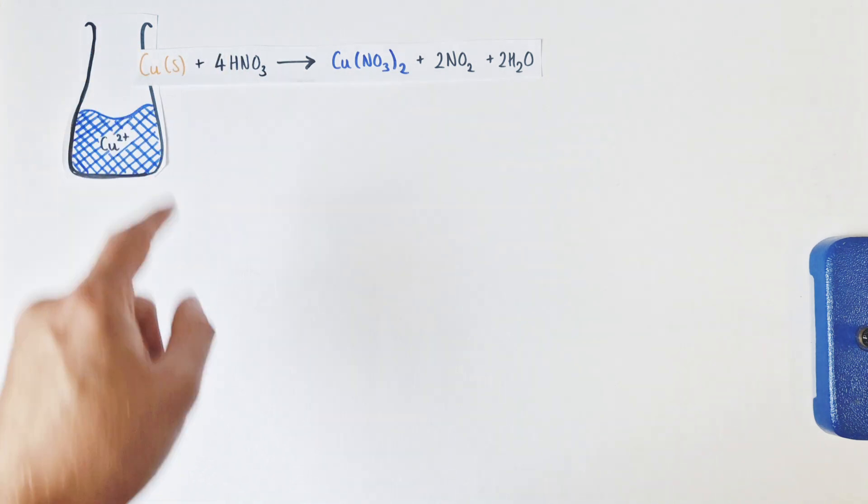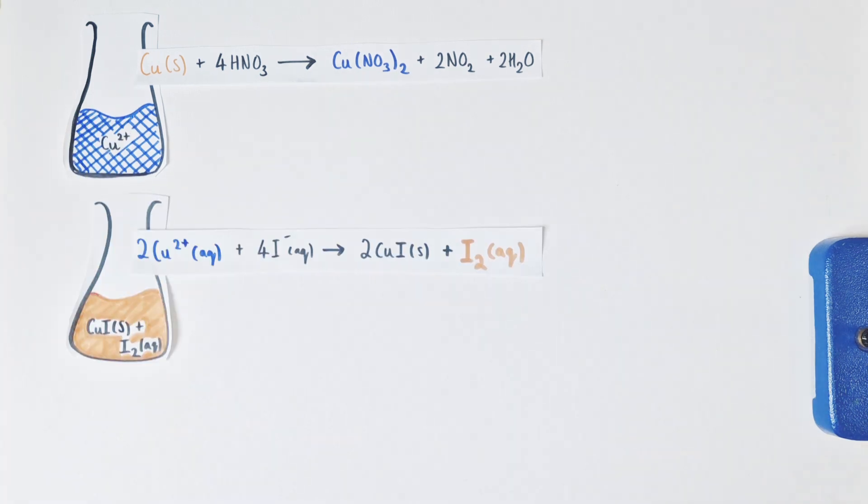We need this reaction to work out the mass of copper later on in our calculation. Now those 25 centimeter cubed samples of copper 2+ ions were being reacted with excess potassium iodide bringing iodide ions and the reaction taking place between those two ions is producing copper iodide which is the white precipitate and iodine as well. And that's this murky brown suspension we've got in the conical flask here. So this is the second reaction taking place and the key point is we're now making iodine with this second reaction.